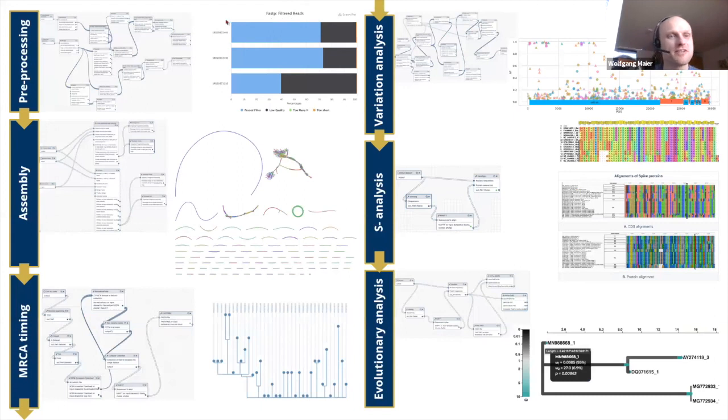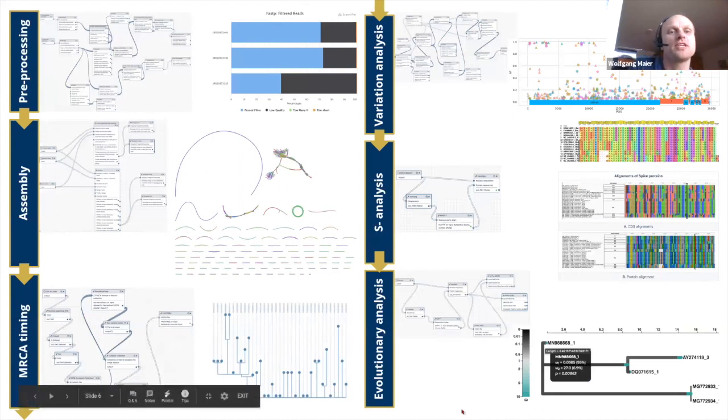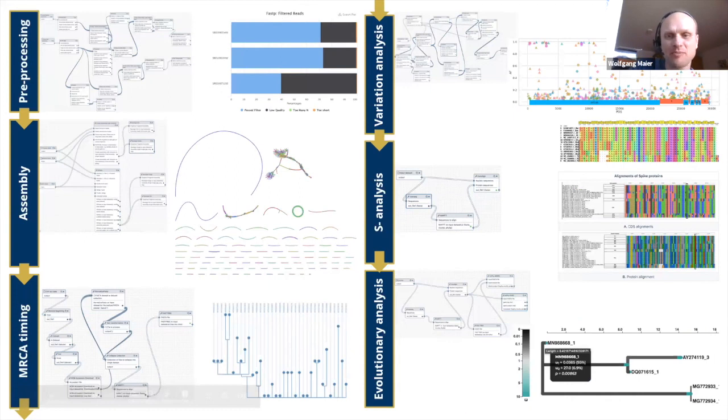Welcome, everybody. Good afternoon. What you're seeing on this slide is basically the status of the project when I was talking about it in summer last year, in the first round of this webinar series on COVID-19. What we had at that time was a response to the early needs of science during the just emerging pandemic.